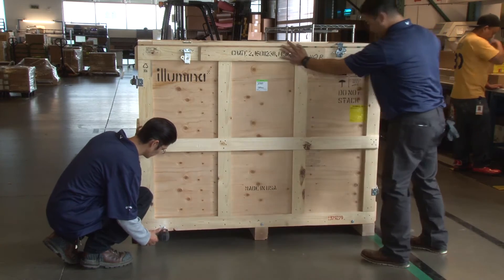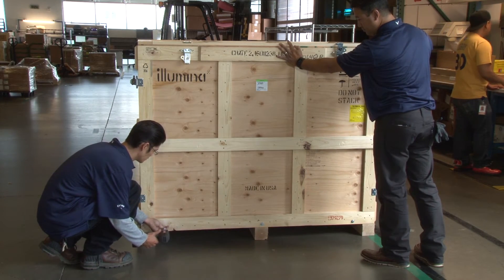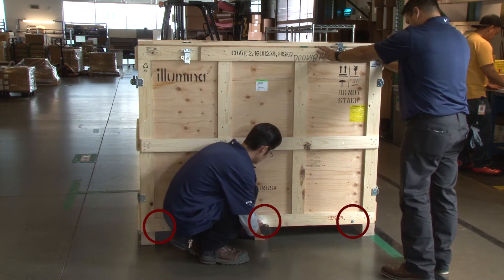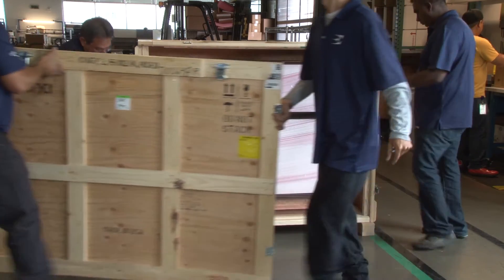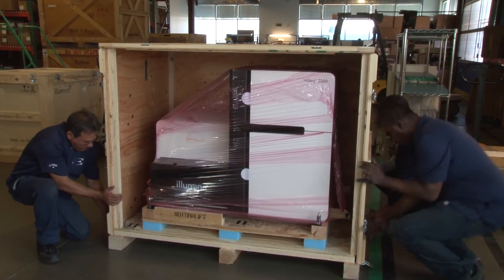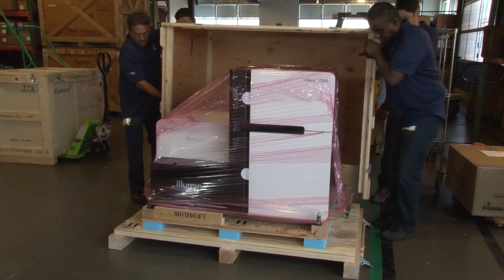To begin uncrating the HiSeq instrument, using a socket wrench, first remove the three bolts. Next, remove the front panel of the crate. Unlatch and remove the remaining top panels of the crate from the base.